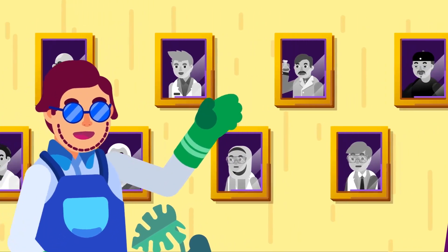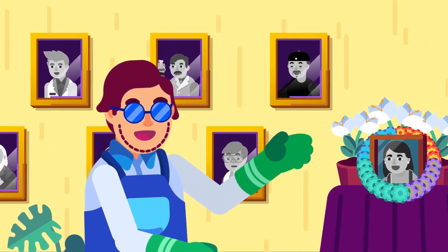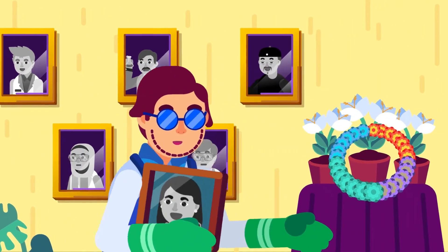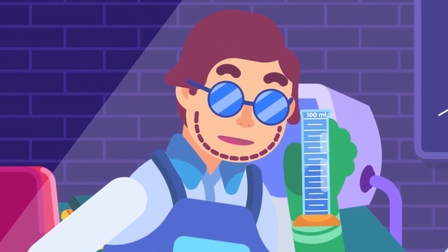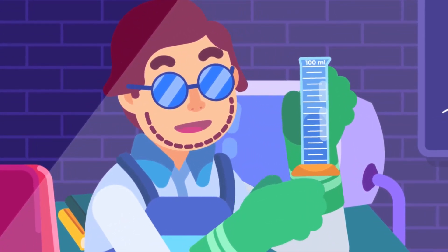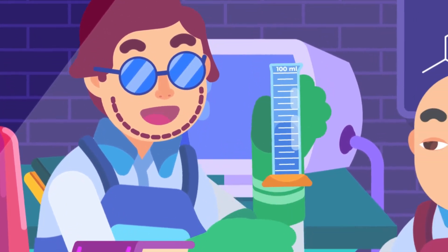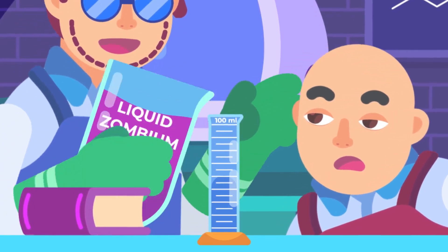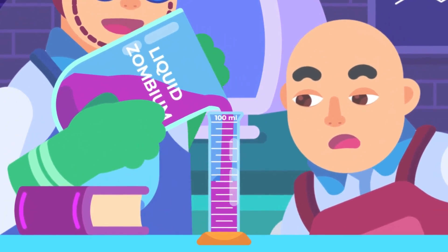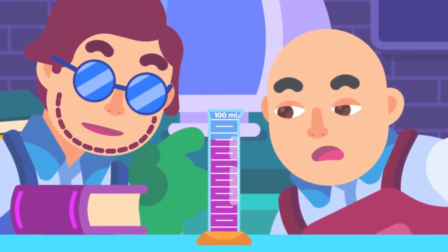It's been used by learners all over the world for decades and helps scientists and non-scientists do science and general volume measuring. A graduated cylinder or measuring cylinder is a tube-shaped tool made of glass or plastic with a base for stability. It has scales in milliliters or cubic centimeters to measure volume precisely. For liquid, simply pour the substance into the cylinder and properly read the measurement at the scale.